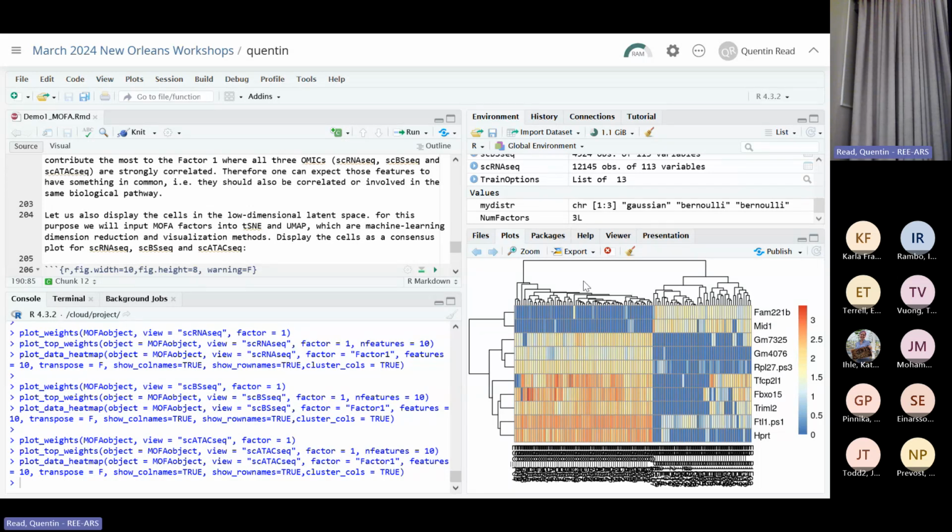We've reduced this 20,000 by 100 to 20,000 by 3 and 3 by 100, a much, much reduced data set compared to the huge original data set, and still explained something like 15 or so % of the variation in that very, very big data set with fewer factors. So those may be the ones that are most important for differentiating our cells from one another.